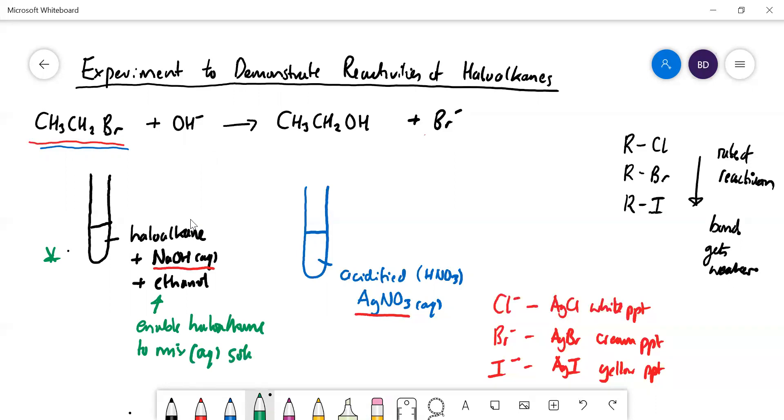Now at every minute or so what you're going to do is get a pipette and stick it in there, take a little bit of that out, and then you're going to add drops of that into the acidified silver nitrate.